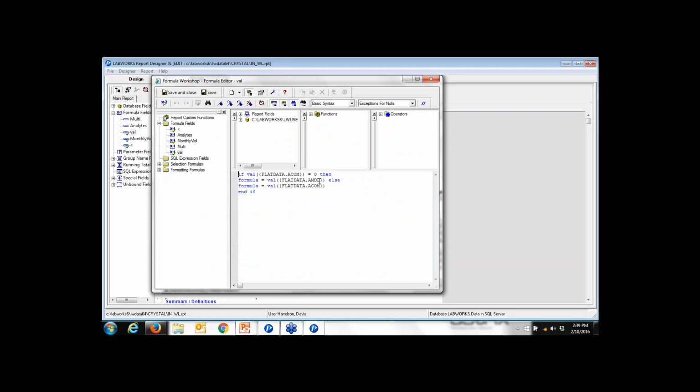So in this particular program, if I have a less than entry in my result field, or if I have a non-numeric text value in my result field, I want to use the MDL in the calculation. Otherwise, take the value of that text field. This particular formula converts it into a numeric function, and then subsequently you can use it within your calculation.